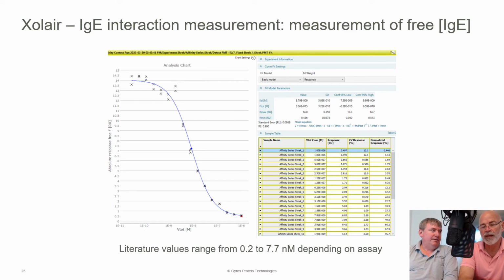Yeah. One thing I'll often remind myself is that this is usually a linear scale on the y-axis. Normally in our PK curves and things, people are looking at very wide concentration ranges, so they'll often have that be a log scale, and so you're used to seeing very tight overlapping dots. And so that's why I'll often use the table at the lower right.